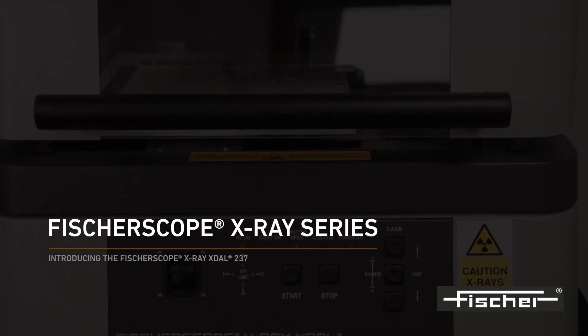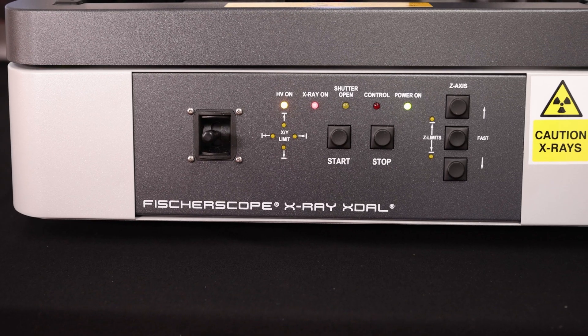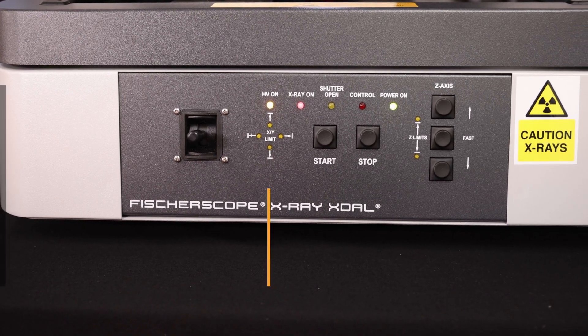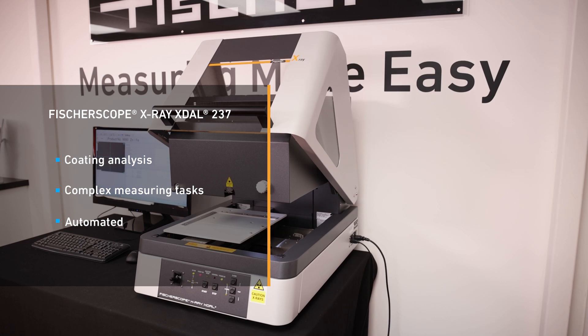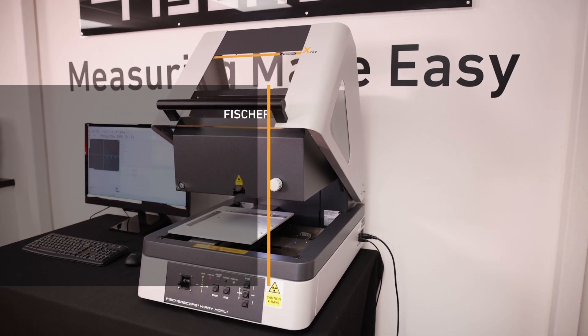Introducing the Fisserscope X-Ray XDAL-237. The Fisserscope X-Ray XDAL-237 is a universal instrument ideal for the non-destructive measurement and analysis of very thin coatings, even with complex compositions.